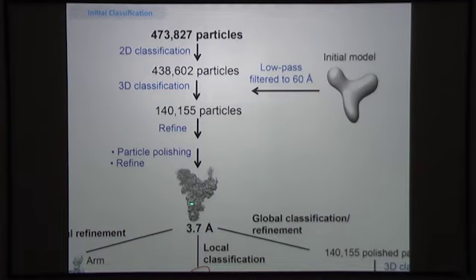But you can see that this is not very homogeneous through the whole map. There are regions where there's almost no density, and regions where the resolution is higher, etc. So how to account for all these different regions or improve the resolution in these regions?